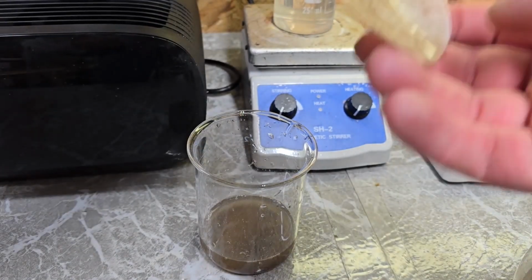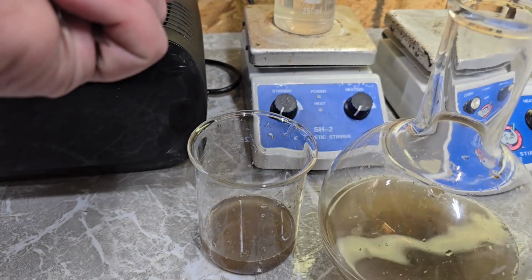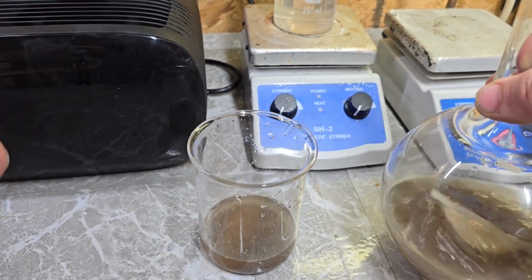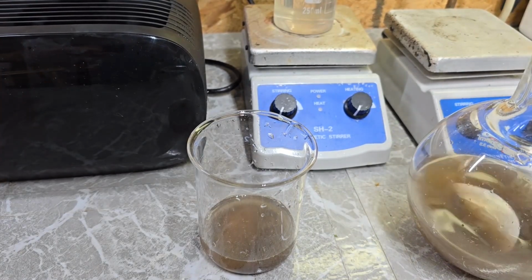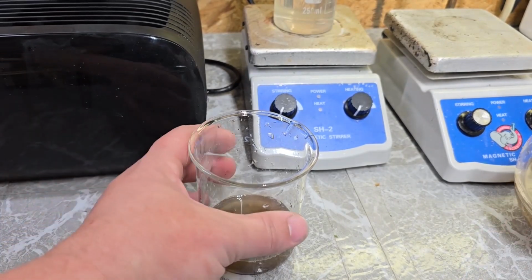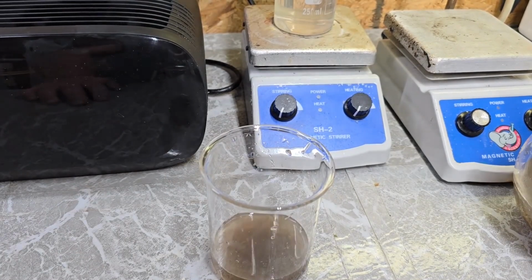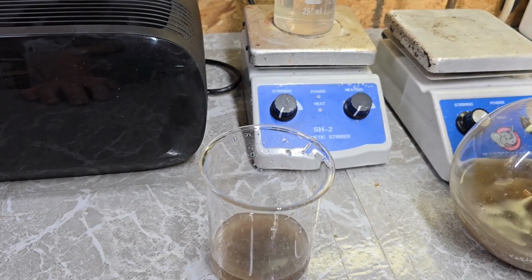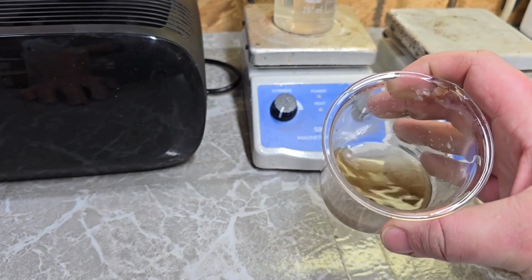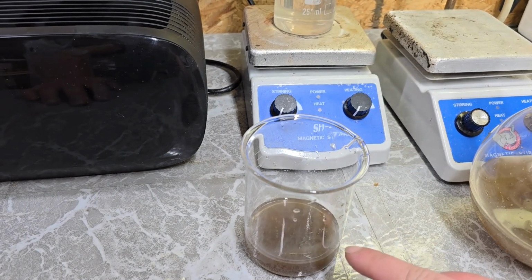I'm actually going to put the leftover filter paper in here, in the water in this flat bottom boiling flask, just to make sure that whatever is stuck on that filter paper, because there's probably obviously still stuff stuck on it, stays with the sample. I want to try to keep this concentrated to the best that I can as well. But I think that this is a really good start. So we have, I think, our best chance of finding stuff in here.